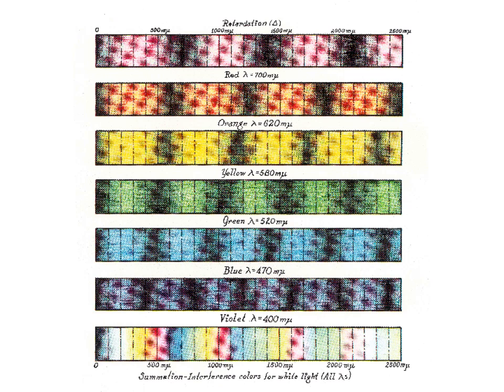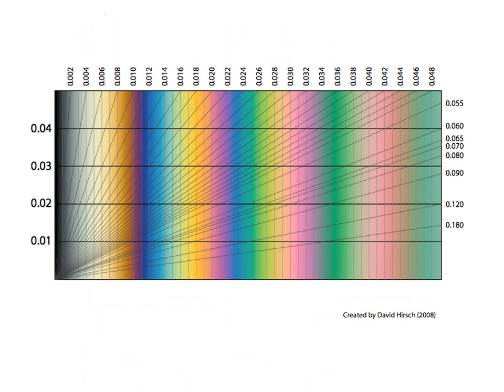The result is this interference pattern of colors at the bottom of the screen, which sort of repeats, but not perfectly. This is a more precise version of that diagram. This is an interference color chart, increasing from black on the left, which means there are no split rays, there's no birefringence, there's no retardation, across to very, very high retardation and interference on the right.